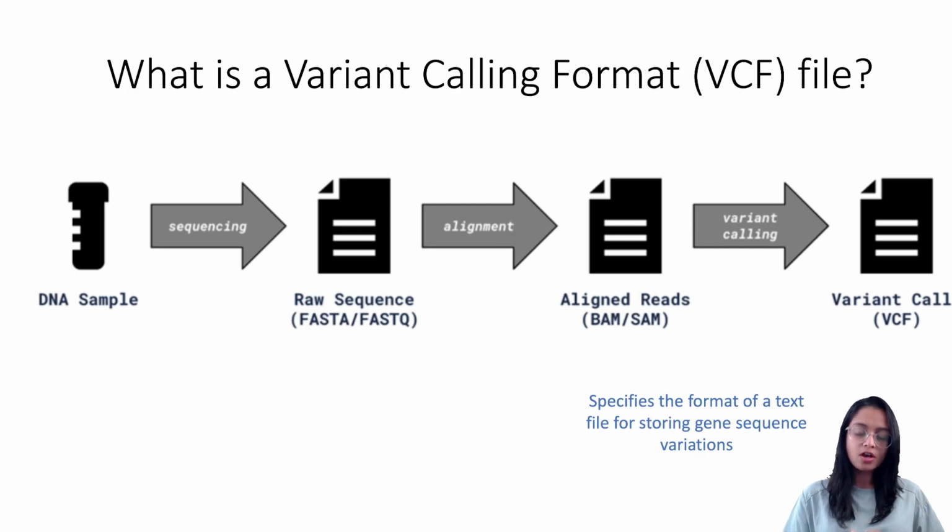A word of caution: a VCF file, however, is a text file, should never be opened in a text editor like Microsoft Word, as this could screw up the format and could corrupt the files. Such a file should always be opened in a Linux or Unix environment, and it's safe to open such files in such an environment and take a look at those files, or even subset a few lines, or fetch relevant information. But such a file should never be opened in a word processor like Microsoft Word.